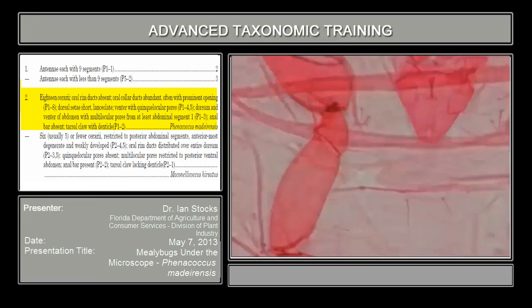The notable quality about this species, the circulus in this species, it's not always visible depending on the mount, but in a good mount, and actually when, as John was saying, in alcohol, when the waxes come off, you can actually see this shape through a stereoscope. It actually kind of looks a little bit like a mushroom that's been in cross section. So there'll be almost a central shaft, and then there'll be almost two wings that come out as curves a little bit. Okay.